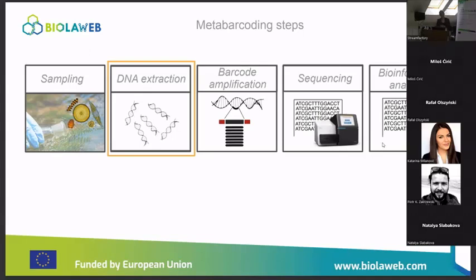Also for DNA extraction, you put in a sample that is supposed to have no DNA in it, and you go through the protocol. At the end, you look if you have DNA. There is a problem if you do, because you shouldn't. For the field, for example, you take a filter and put a buffer and proceed with this. So sterile water, for instance. Or sterile water. Yes, you take the filter with sterile water and look.